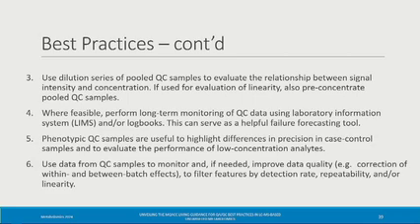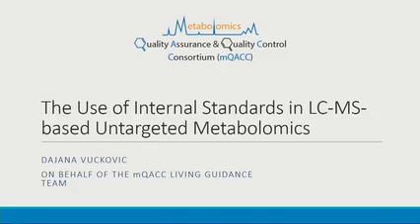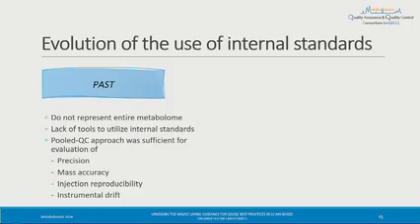So now, let's switch gears and talk a little bit about the use of internal standards in LC-MS untargeted metabolomics. If you look at the evolution of the use of internal standards in untargeted metabolomics, the use is a little bit haphazard historically, right? The idea was that it was not possible to pick internal standards that would be representative of the entire metabolome, and generally the movement was towards using a pooled QC approach to monitor repeatability and technical performance.